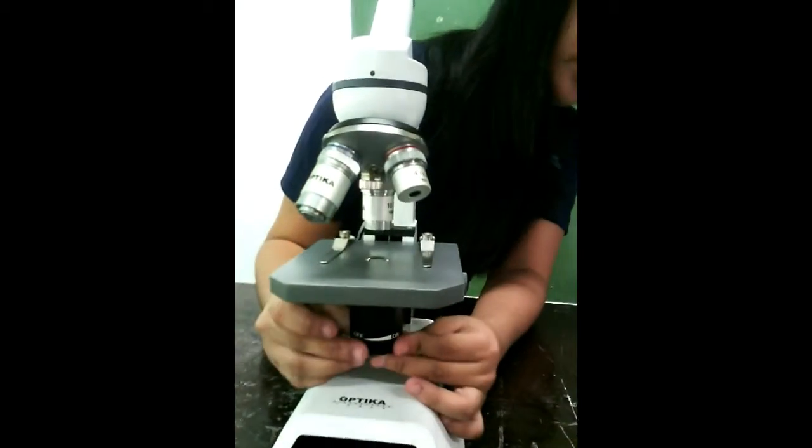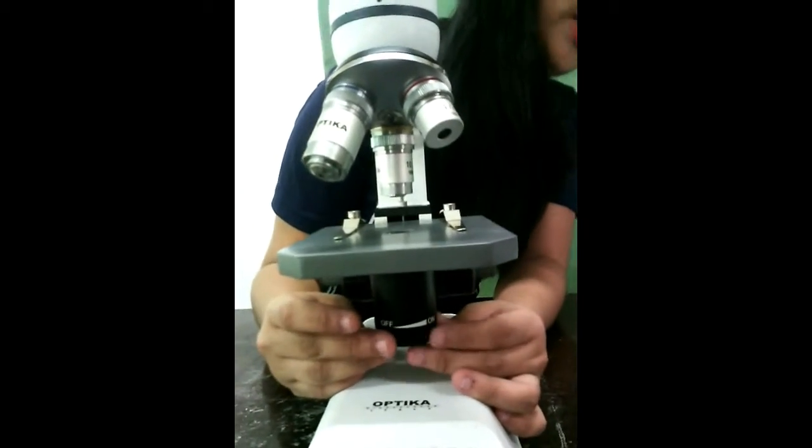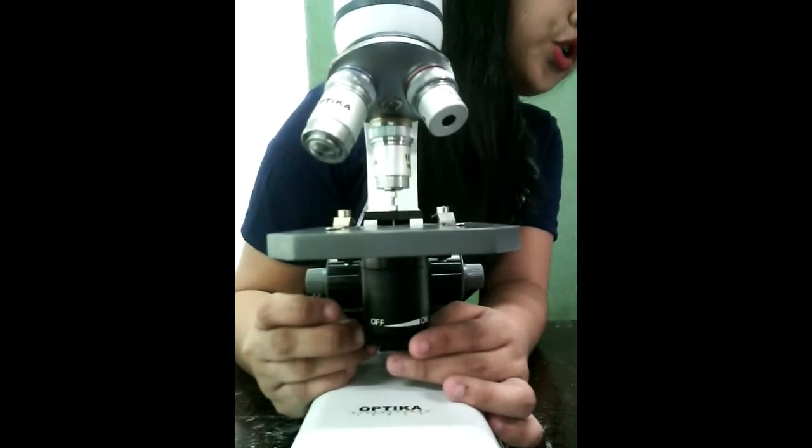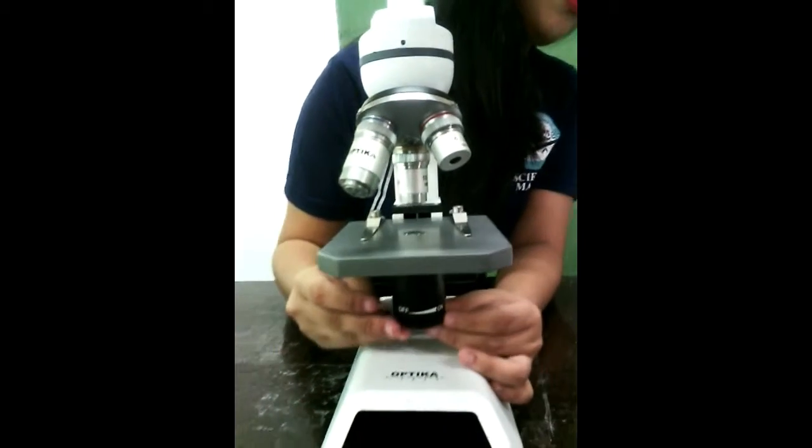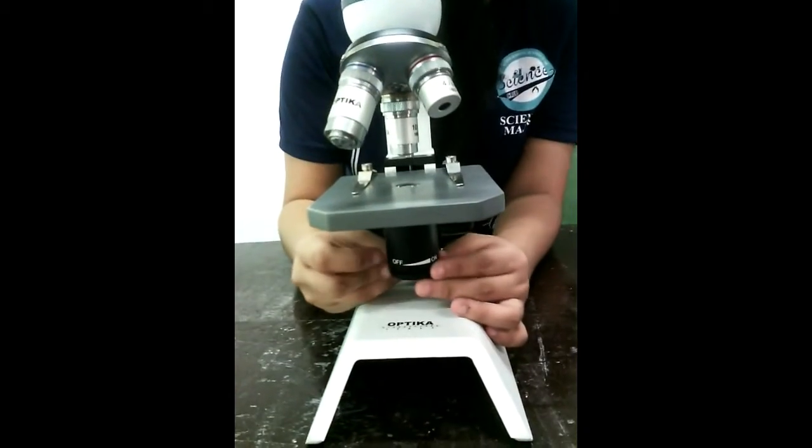The condenser, located on a substage held in place by a rack, is used to condense or concentrate the light reflected from the mirror to the object or specimen being examined.